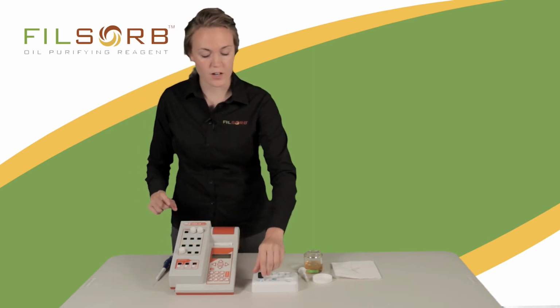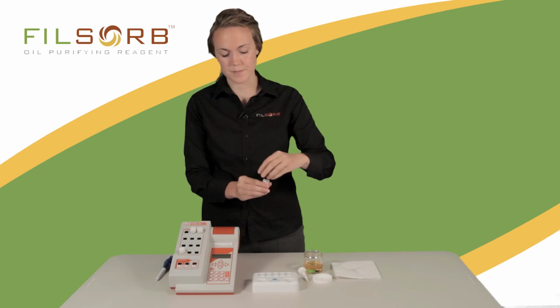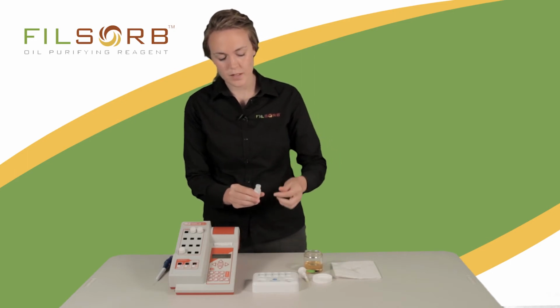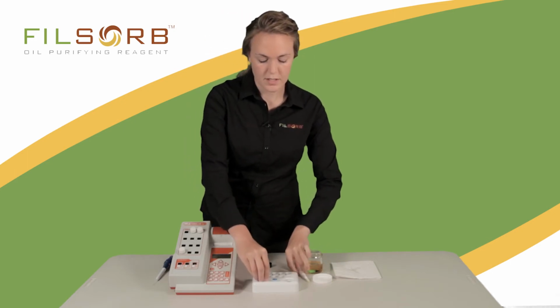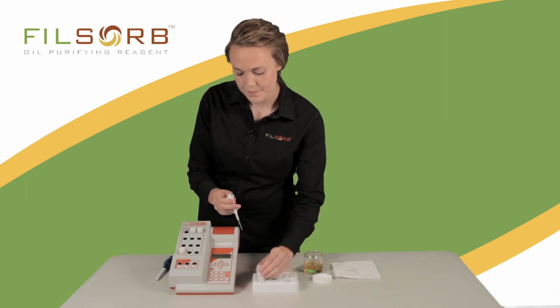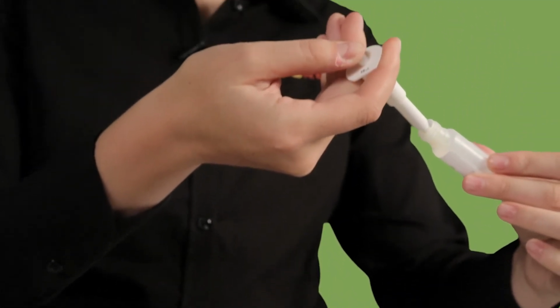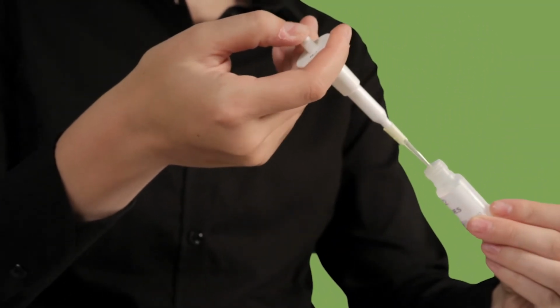Now it's time to add your R2, your reagent number 2. Do this after you add the oil. You will do this using your mini pipette in your kit. You want to press the plunger down, insert it into the R2, tap off. There should only be a small amount in there.